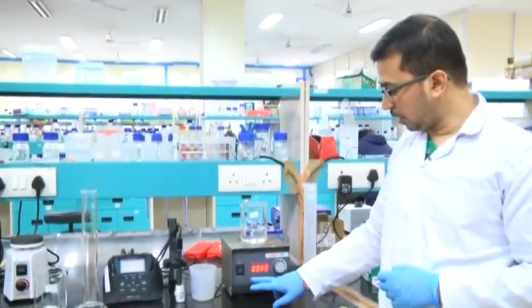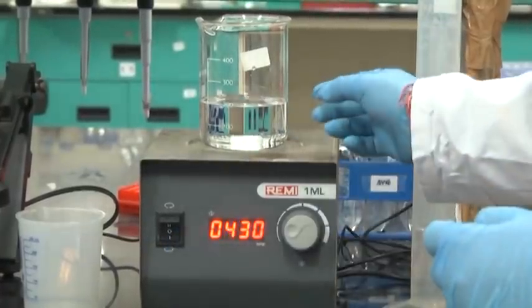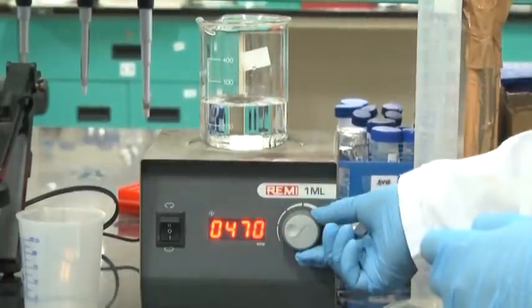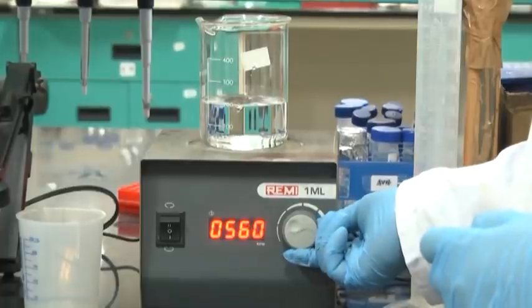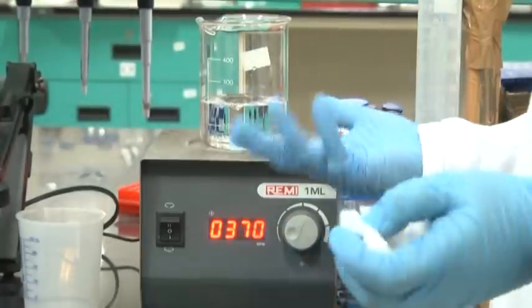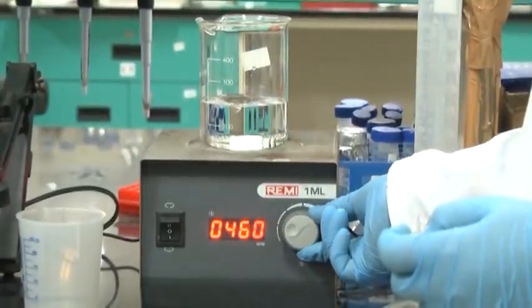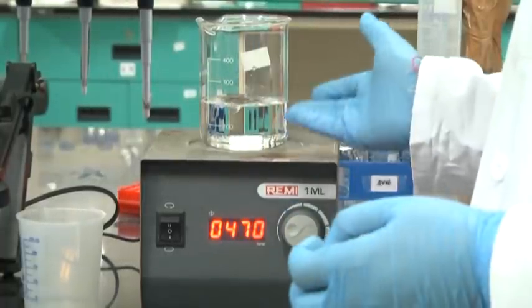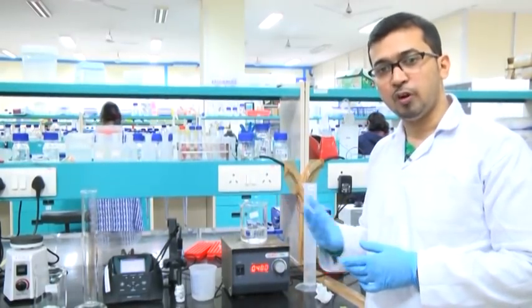This is the magnetic stirrer — I am turning the switch on here. We can see the magnetic bar has started to rotate. We can adjust the speed using this regulator; we can increase or decrease it depending upon our required solution. Here, once we keep it running, we can see the solute components dissolving in the beaker and then go for volume adjustment.